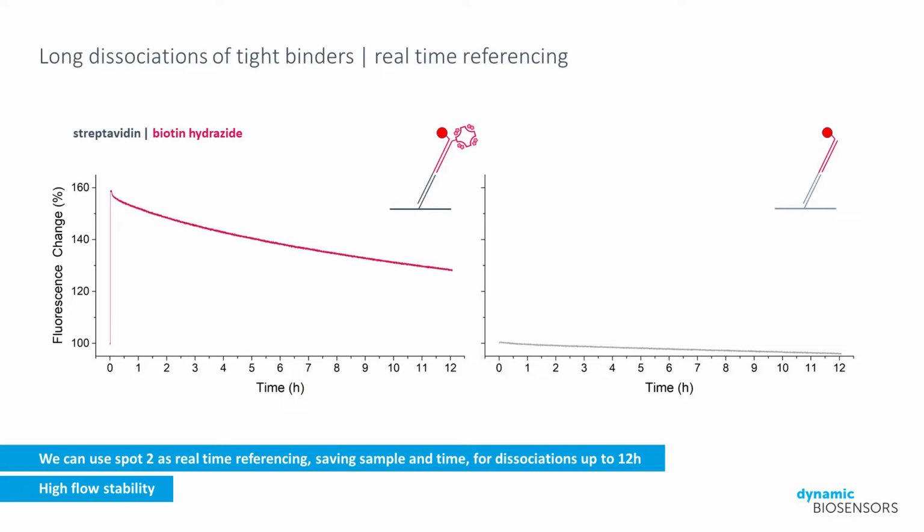This often requires a much longer dissociation time than other interactions, and many biophysical systems struggle to achieve this due to low stability, high sample consumption, and in general long-term degradation. With switchSENSE, you can nicely measure fast association and long dissociation at the same time.